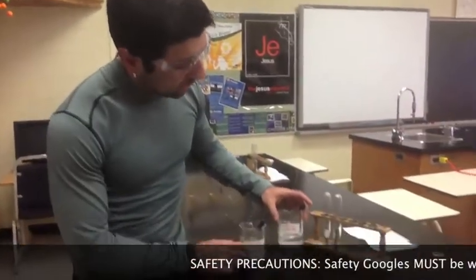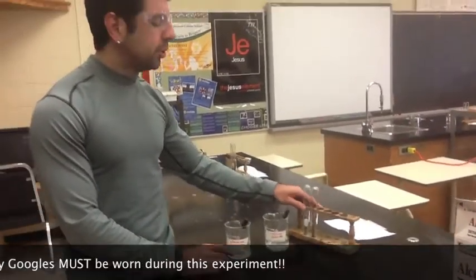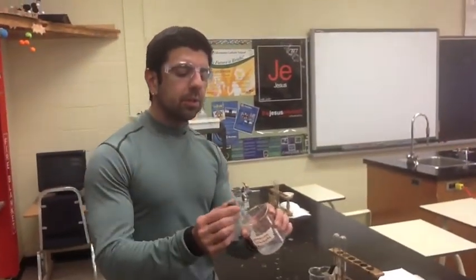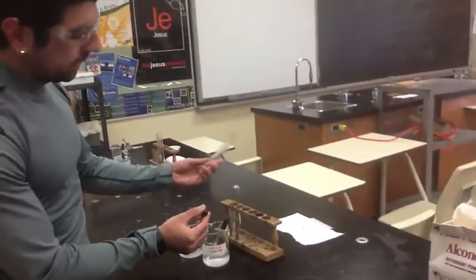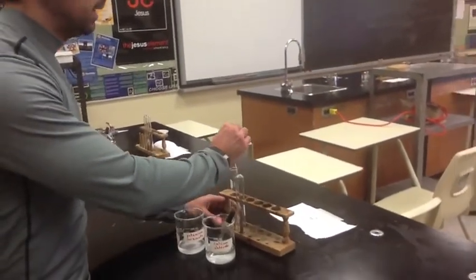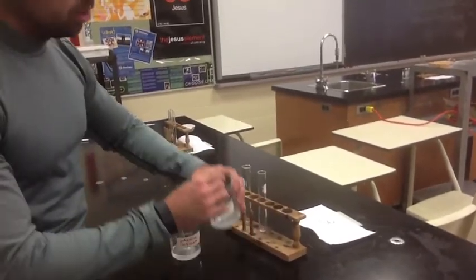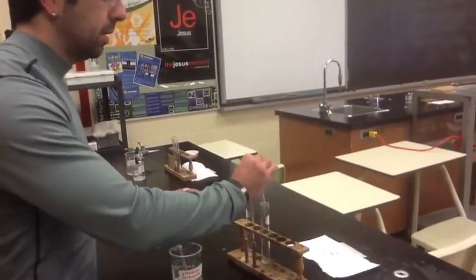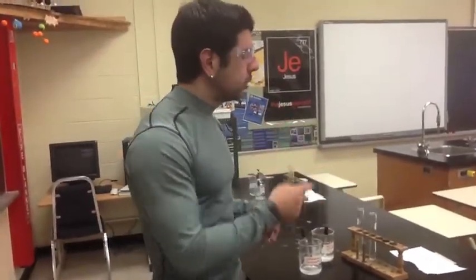Okay, so in this station you're going to have two beakers, one with calcium chloride, the other with potassium carbonate. You're also going to have two test tubes with your test tube wrap. What I want you to do is take 3 eyedroppers full of potassium carbonate and place it into one beaker. You take the other beaker and put in 3 full eyedroppers of calcium chloride. I'm only going to do 1, but you're going to do 3. You're going to do that 3 times in each one of the test tubes.